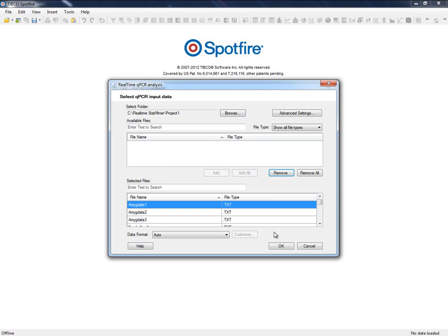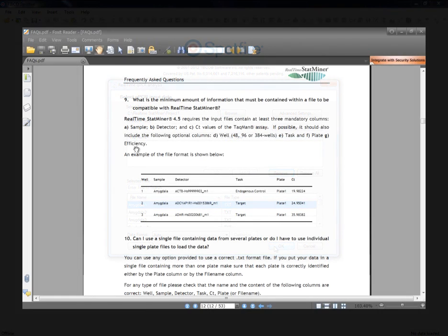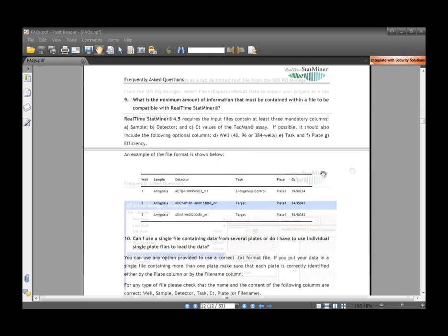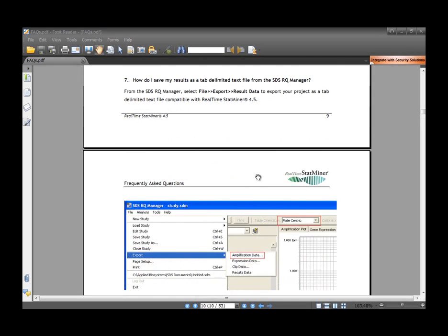StatMiner automatically supports a wide range of qPCR data files from various platforms. It is recommended to check frequently asked questions in order to get further details of the information that should be included in the input files and how to export data from the native platform software.